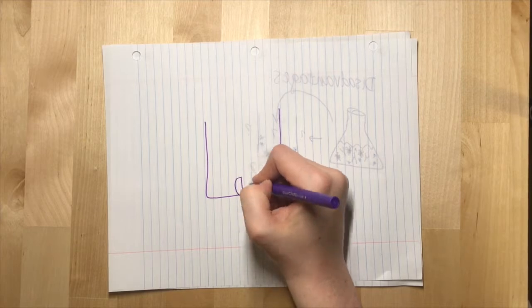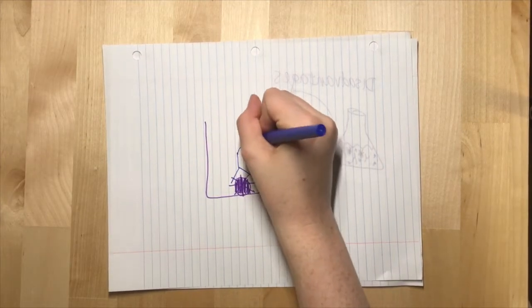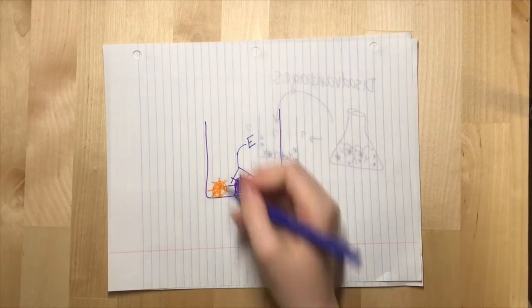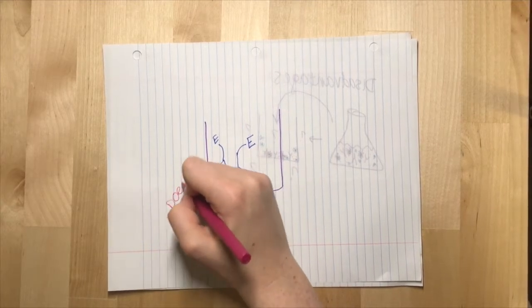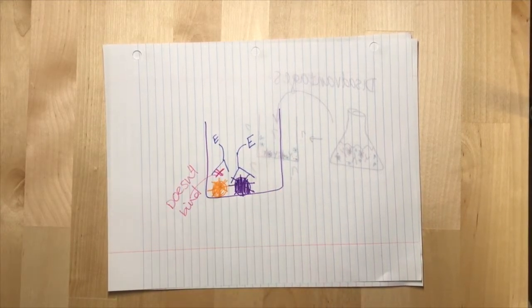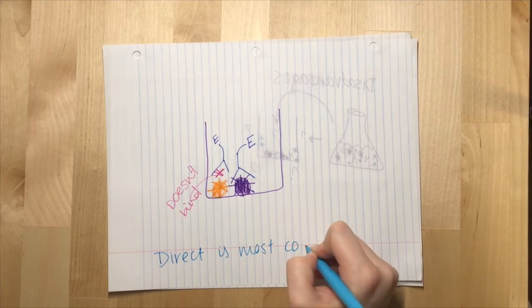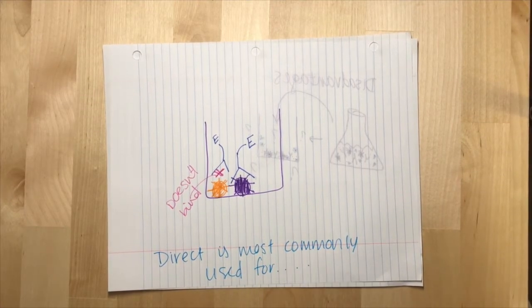Also, you want the enzyme-linked antibody you add to bind only to the antigen you're interested in. This can be a disadvantage because finding an enzyme-linked primary antibody specific to your antigen can be expensive. Overall, direct ELISAs are most commonly used to determine ideal concentration or dilutions for primary antibodies to be used in other experiments, like Western blot.